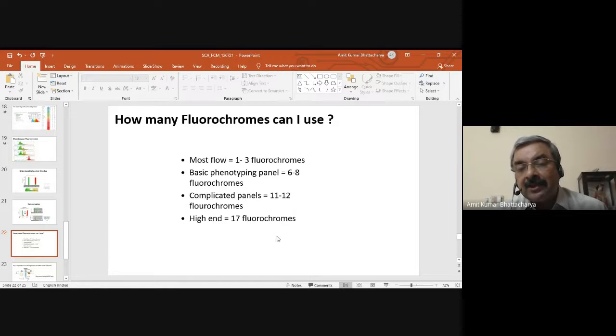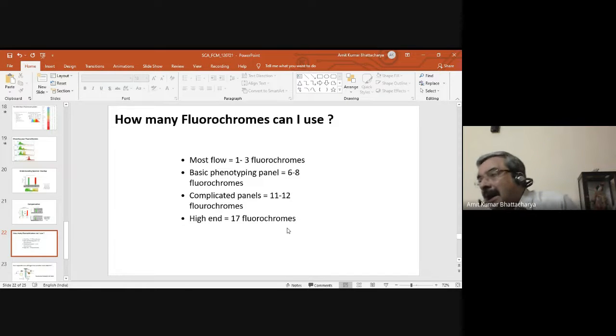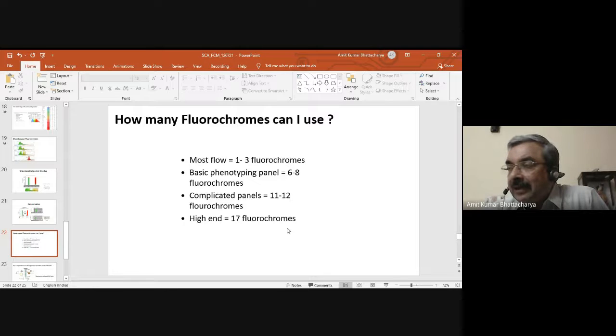But as the number of dyes goes up, the complications of overlap come in, and it becomes difficult to keep on detecting signals when you're using a large number of fluorescent dyes. So this also limits how many protein molecules, for example, labeled with antibodies, which are labeled with dyes, you can ultimately see together. That limits that ability.